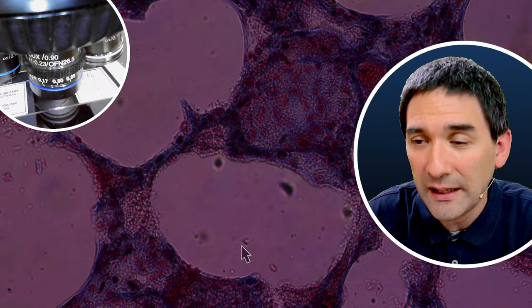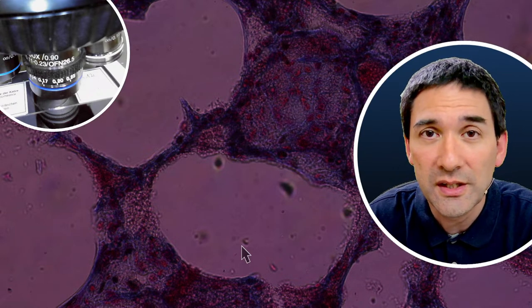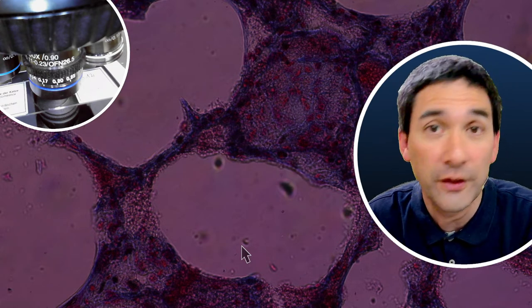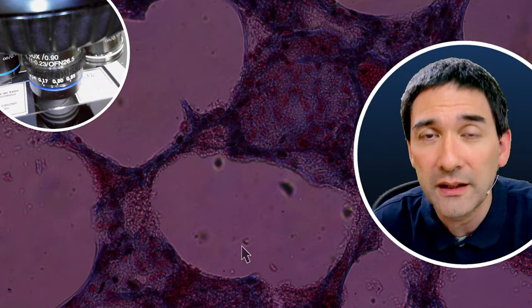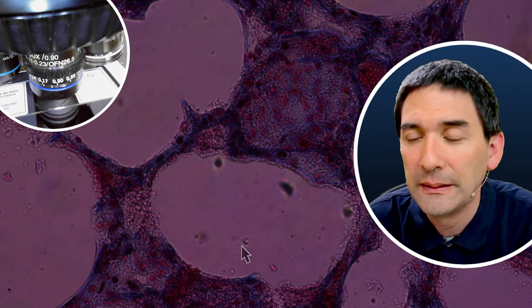So if you have any doubts with this, you essentially have to do a proper microbiological test. Usually, what they do is they will filter the water, and then from the filter, they will try to cultivate bacteria or fungi, whatever is in there, right? But just by looking at the water with a microscope, it's not reliable, yeah? Because still the concentration is too low. Yeah?